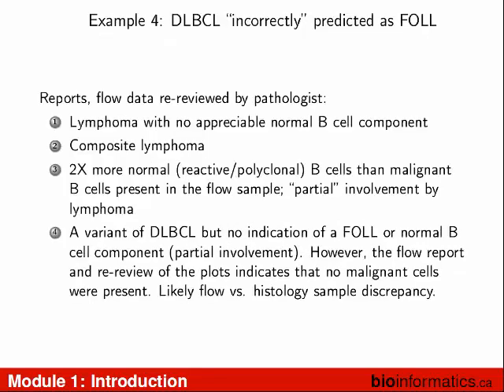Going back to that, when I validate flow assays for CAP valid assays, we have to do calculations for precision and accuracy. We're going to look at positives, positives. The package that we're just looking at, does that help give me a number?